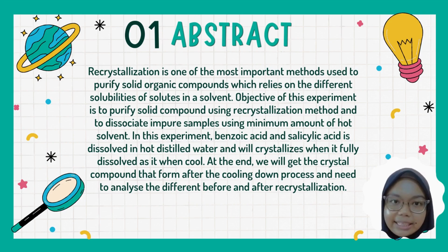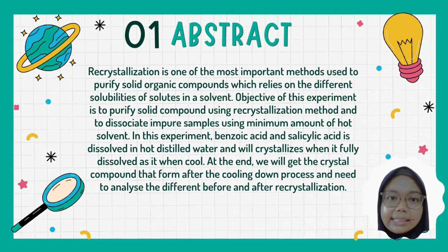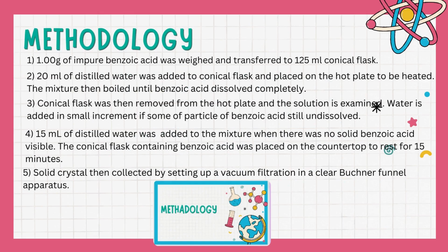of hot solvent. In this experiment, benzoic acid and salicylic acid are dissolved in hot distilled water and will crystallize when fully dissolved. As it cools at the end, we will get the crystal compound that forms after the cooling down process, and analyze the difference before and after recrystallization. I will continue the presentation with the methodology.